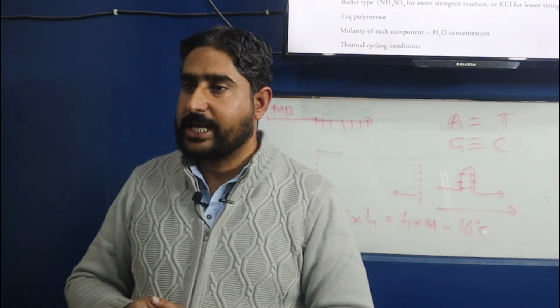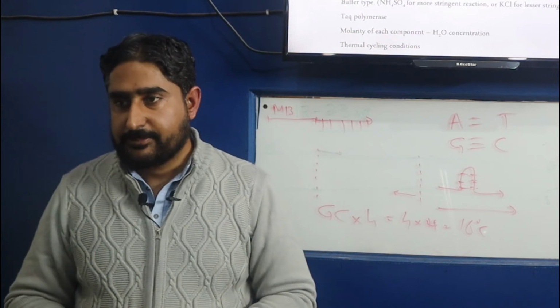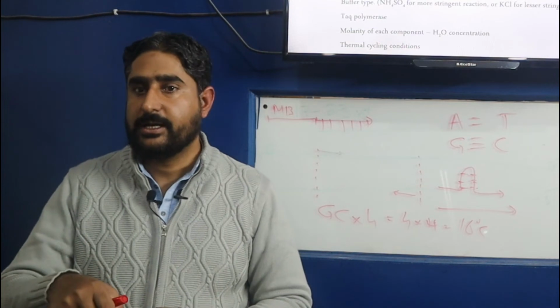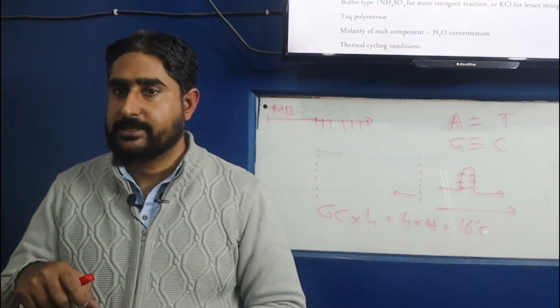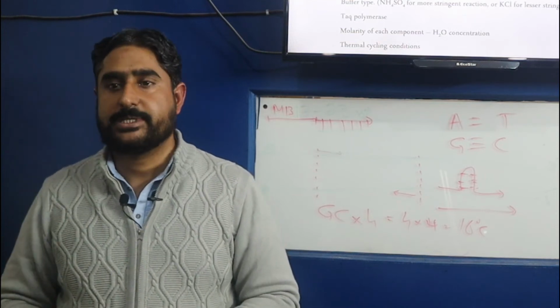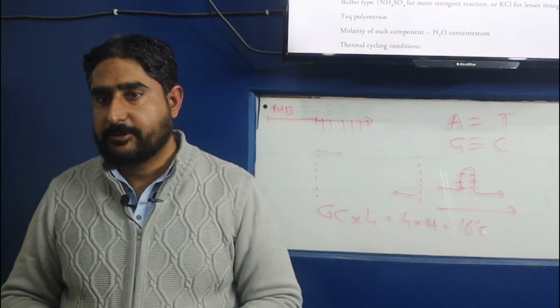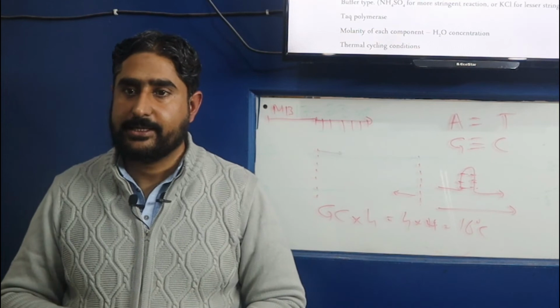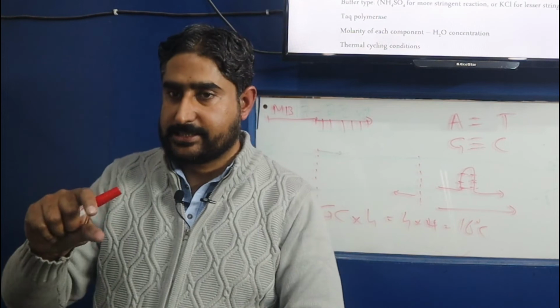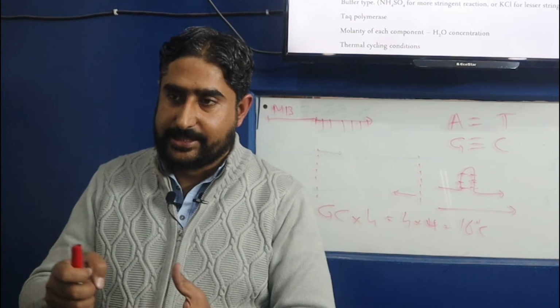So it's important that when we extract DNA and have to store DNA for longer periods of time, we generally prefer to store DNA in TE buffer, because EDTA will chelate any available magnesium ions in the DNA solution, so that DNA is prevented from degradation. Yes, but at the same time, for PCR, when we use that DNA as a template, the EDTA which is present in the DNA will also be added into the PCR mix, and that EDTA will actually chelate the magnesium ions.